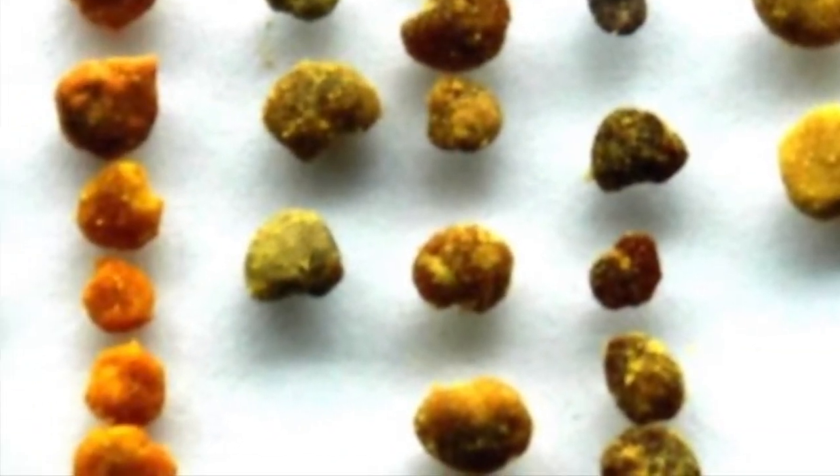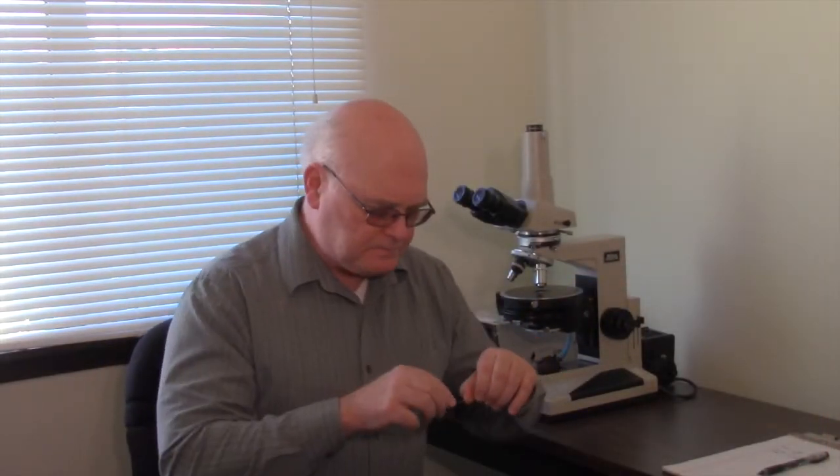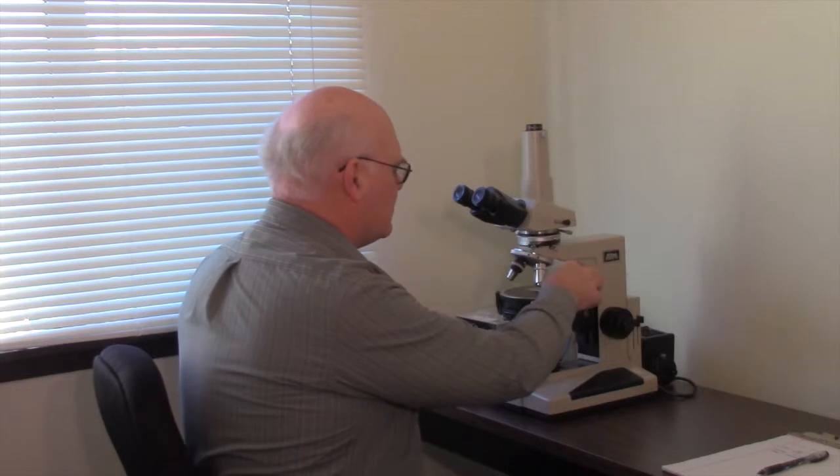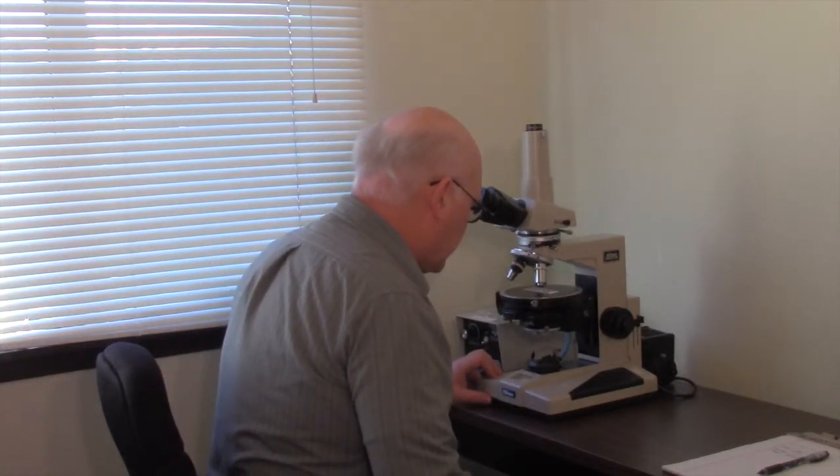This particular pollen is a yellow pollen, a yellow little globule. And when we mounted it, we mounted it in a couple of different refractive index liquids. But we'll start out by looking at it in a liquid that has a refractive index that's just a little different than the pollen.